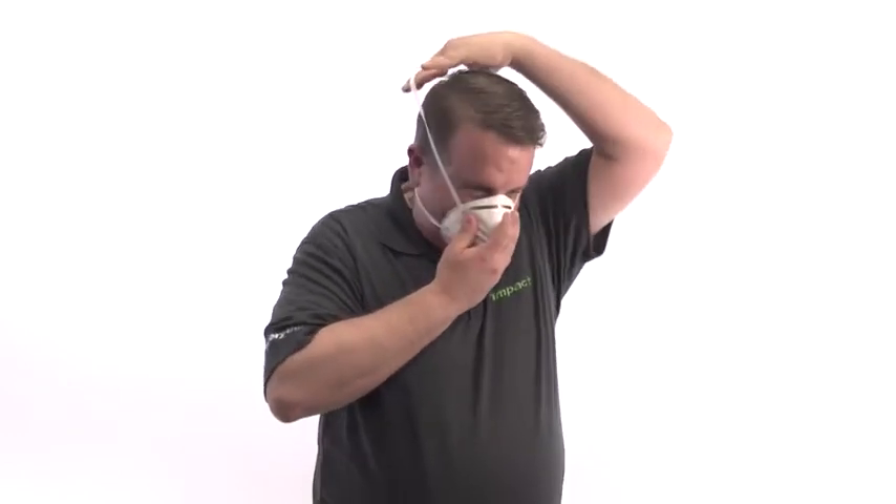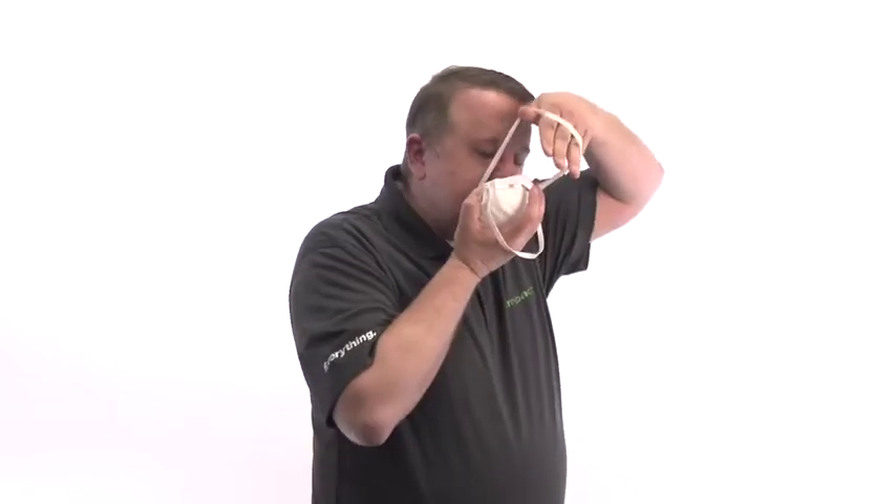Hold the respirator under your chin with the nose piece up. The top strap on single or double strap respirators goes over and rests at the top of the back of your head. The bottom strap is positioned around the neck and below the ears. Do not criss-cross straps.